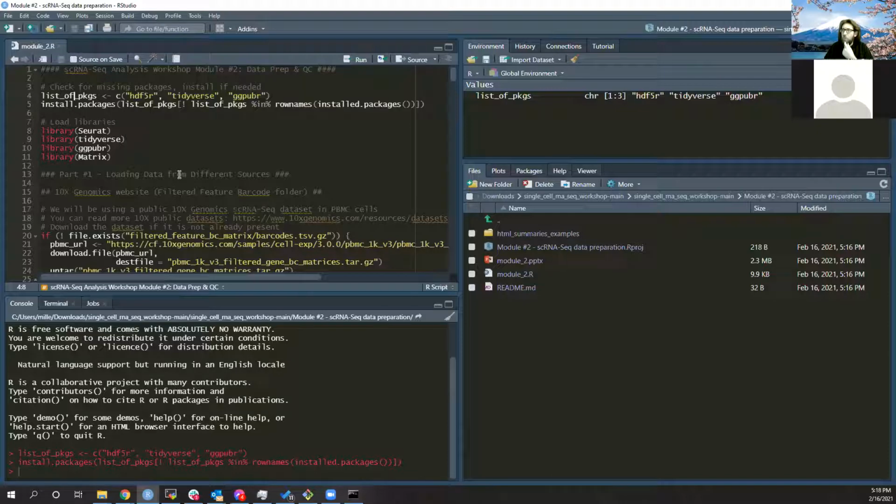Yeah, so today, one of the first things we're going to do, actually, for the sake of time, I'm going to save this for the end so that people who don't want to stick around to watch this part can leave. But I'm going to show you how to get 10x genomics data and other kinds of droplet-based single-cell RNA-seq from a variety of sources. Including both the easy way from the 10x genomics datasets portal or the hard way from Geo, but probably the most realistic way you're going to get it.